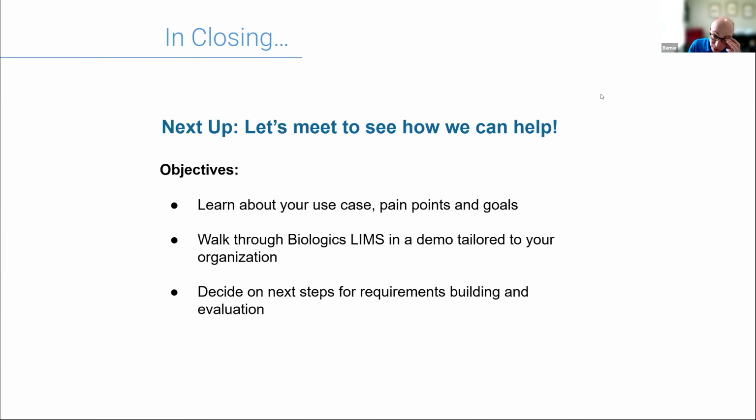And someone asked about LCMS-based assays. Yes. Okay. So, mass spec results that would come out of an LCMS. We have a variety of people that will use this for complex assays like chromatography and mass spec.